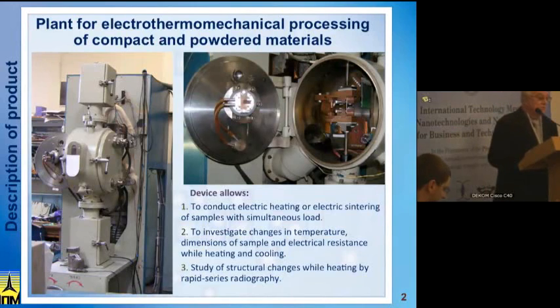So what's new in this case that we wanted to show to you? Primarily, a very successful use of the sensor to register information in the high-speed X-ray.